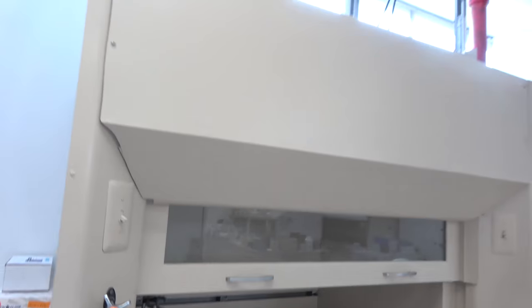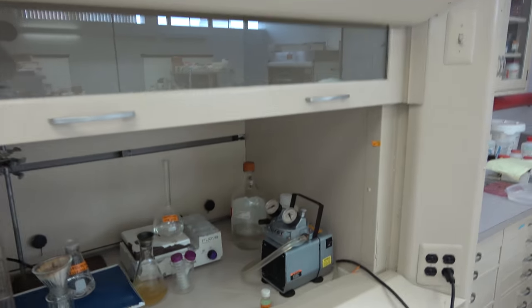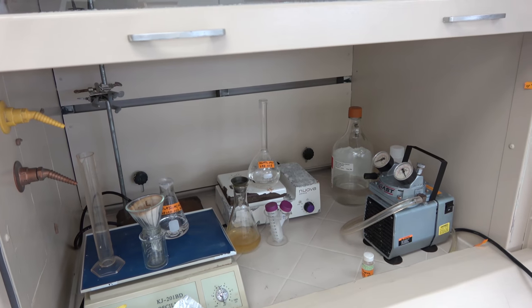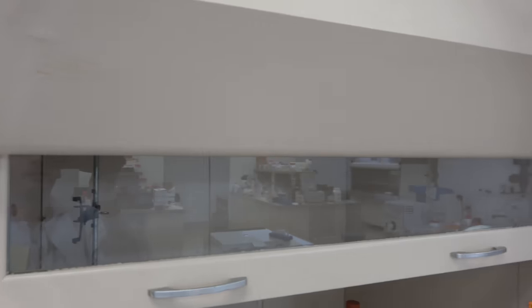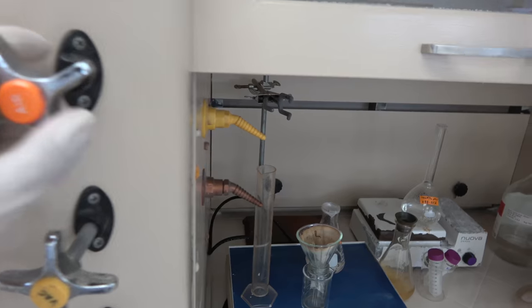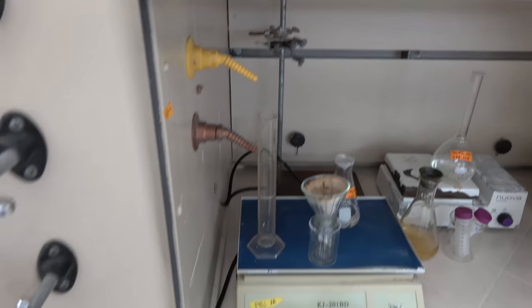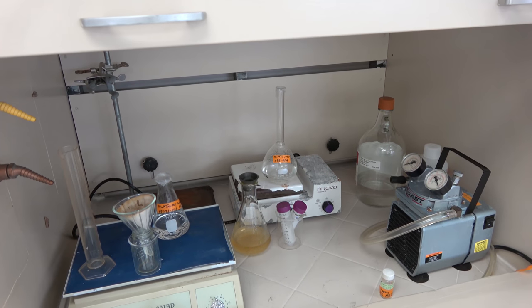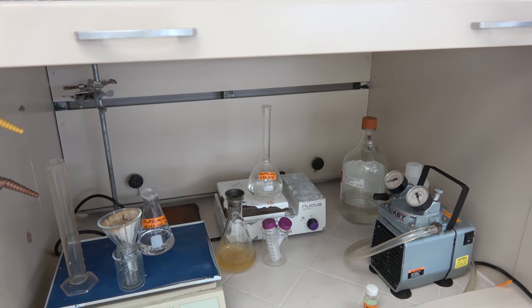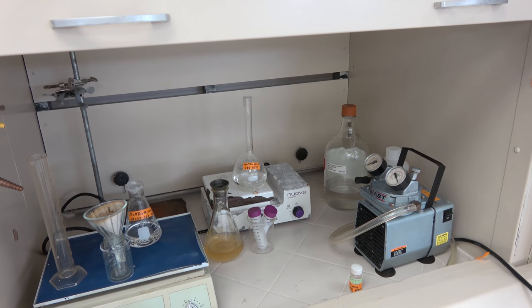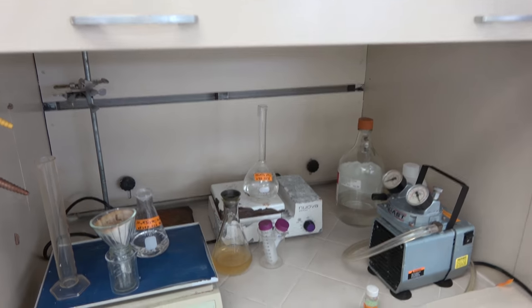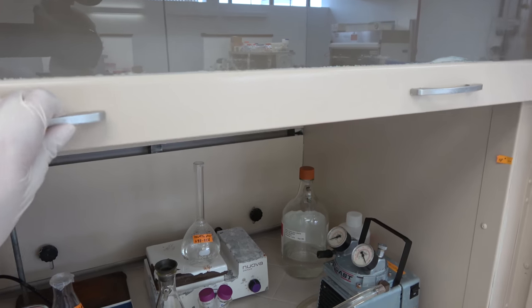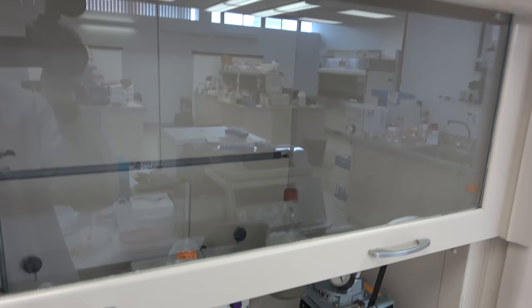So here is what you call a fume hood. It's a pretty self-explanatory thing. If you're working with chemicals that have a lot of fumes you work in here with it and you turn it on and you can hear it going and it'll just suck up all the air out. And then it has other useful things like you can have these little nozzles with air or vacuums or nitrogen whatever. Important thing to note though a fume hood is not just for chemicals that have lots of fumes and will make you cough. If you're working with more volatile experiments you'd want to do it in here so that you can have this protective screen in case something goes fucking boom in your face.